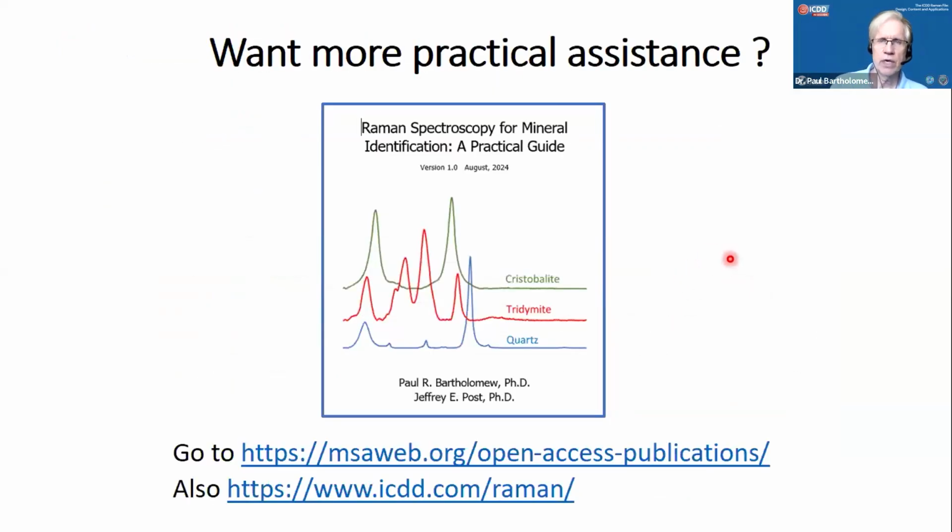I'll just add, if you want to know more about the practicalities, Jeff Post and I have written this document. And again, it focuses on minerals. Many of the principles apply to other materials. It's open access. It's posted on the Mineralogical Society website. It's also posted on the ICDD website and their Raman page.